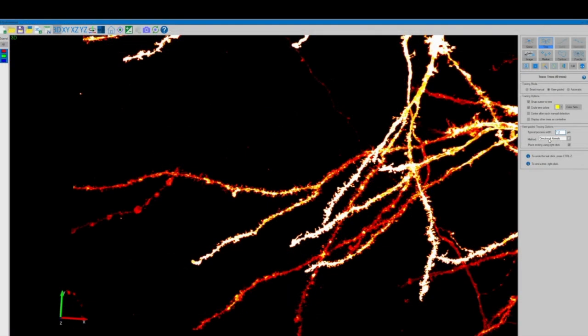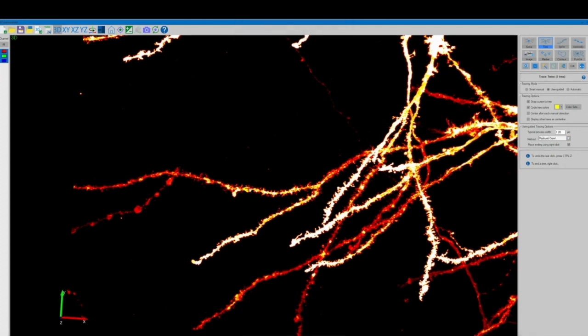There are three different methods for user-guided tree detection, so we're going to select whichever one of those seems to work the best with our image, and proceed to click repeatedly along the length of the tree segment. To end a branch we can simply right click.